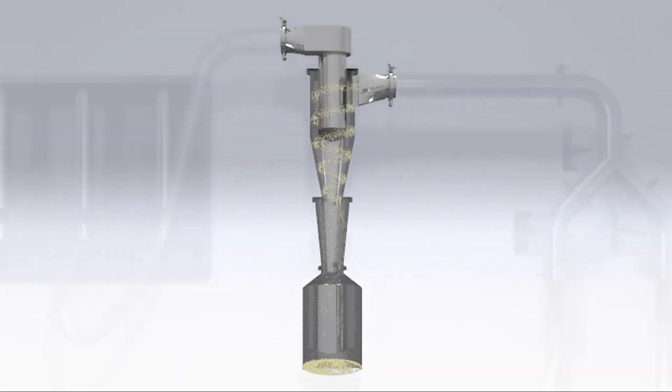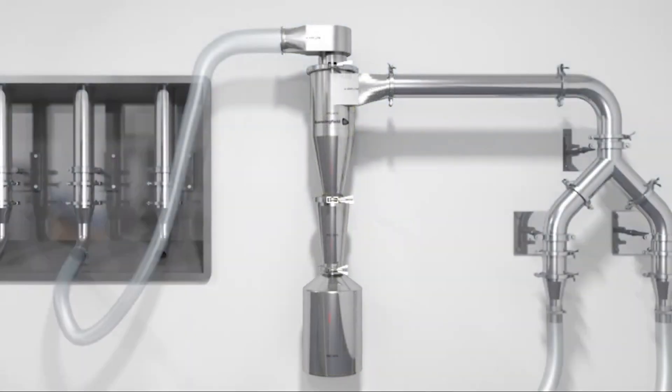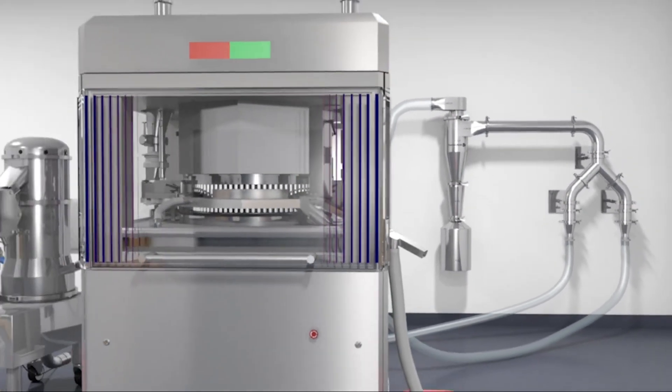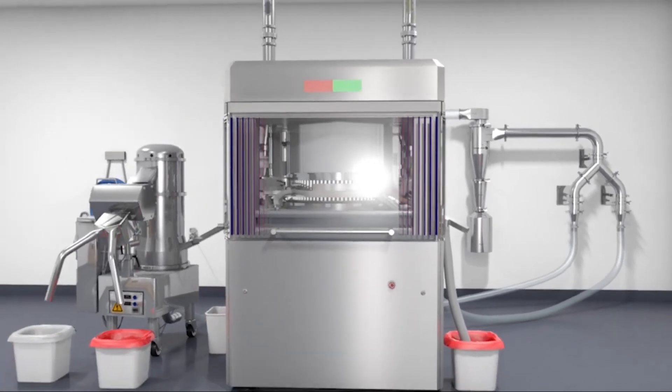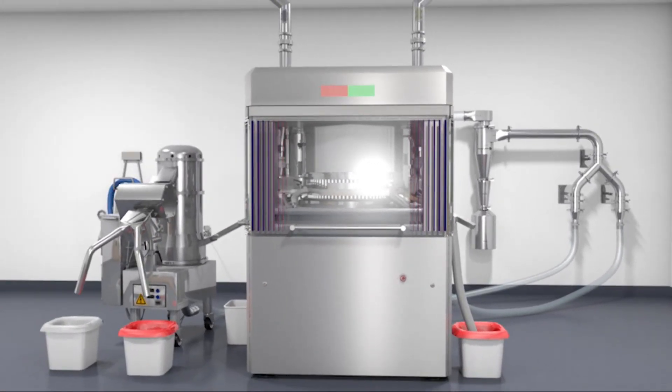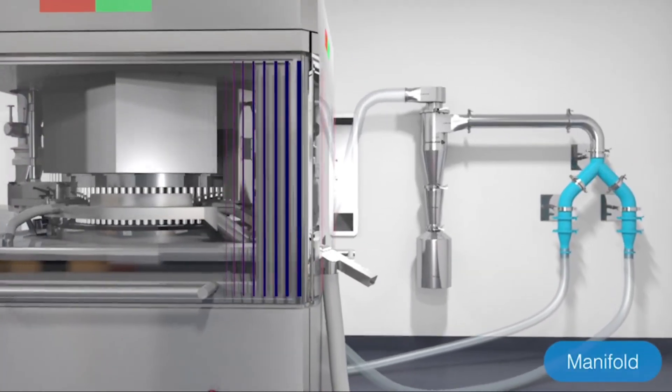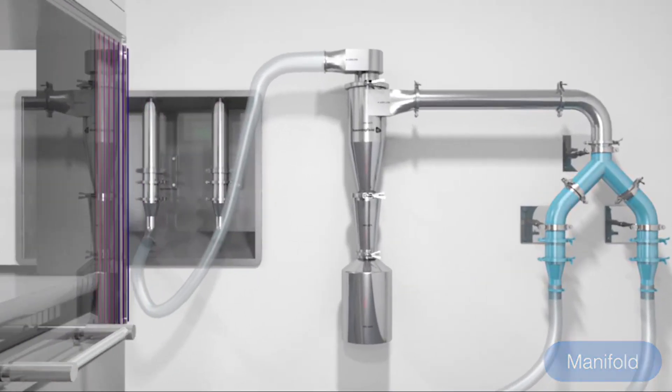Many modern tablet presses have multiple extraction points or incorporate a tablet dedusting unit. Likewise, a capsule filling machine will often integrate a capsule polishing machine. The cyclone is able to accommodate these multiple airflows with the use of a manifold for collection from multiple points.